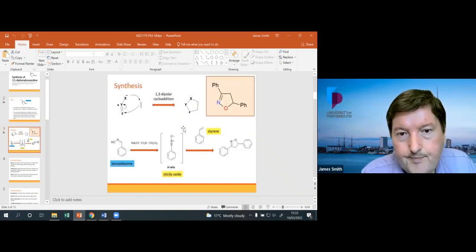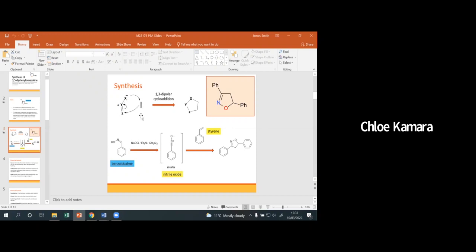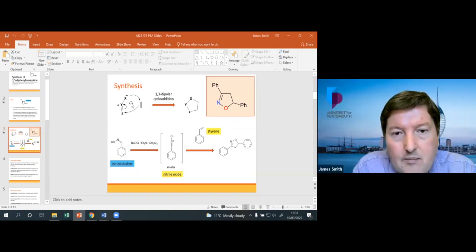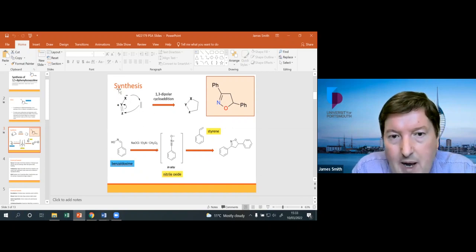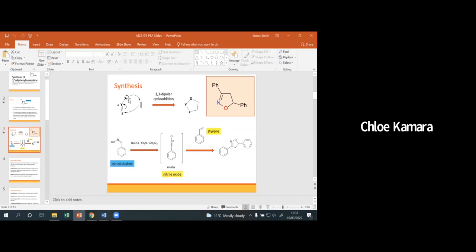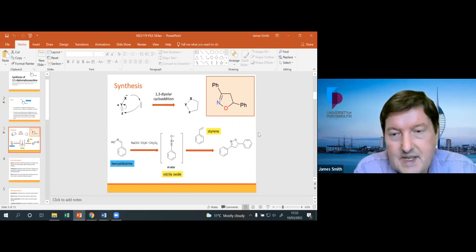Here's the reaction. We might ask you a little bit about this as we go around: a 1,3-dipole reacting with an alkene. We've done about all the curly arrows and all that in the lectures. So I'll ask you a little bit about that, but I can ask you anything, I suppose. That's something you need to be aware of, the reaction going on, X, Y, and Z, and what they are. This is the specific example for this experiment.